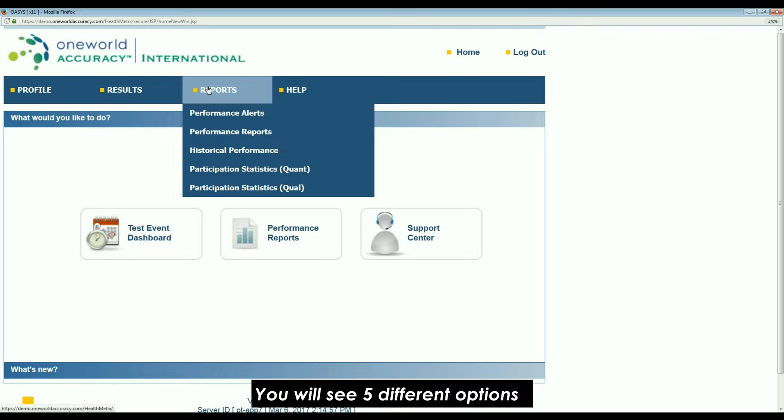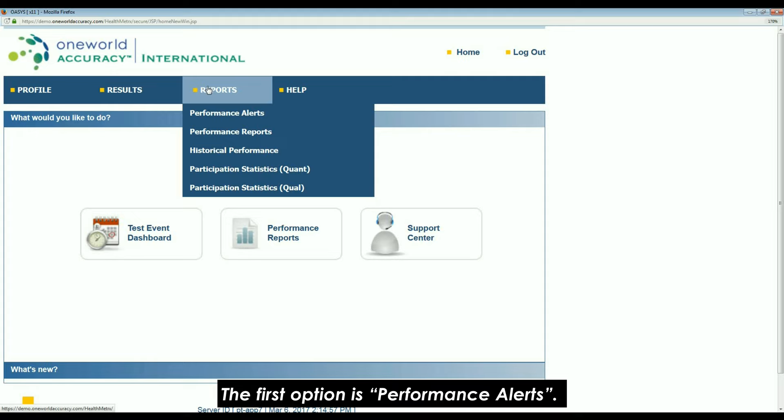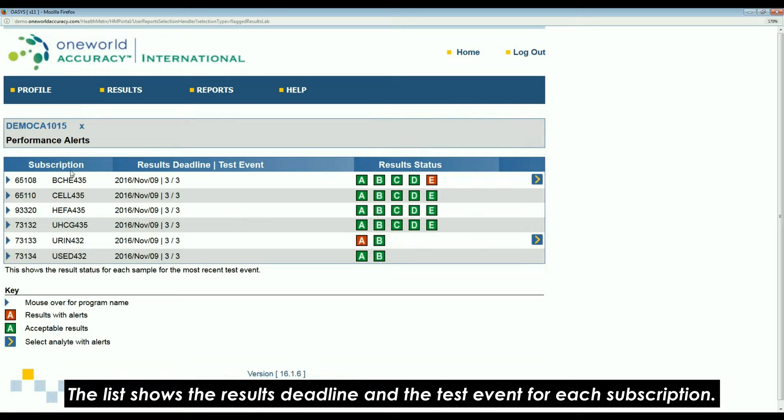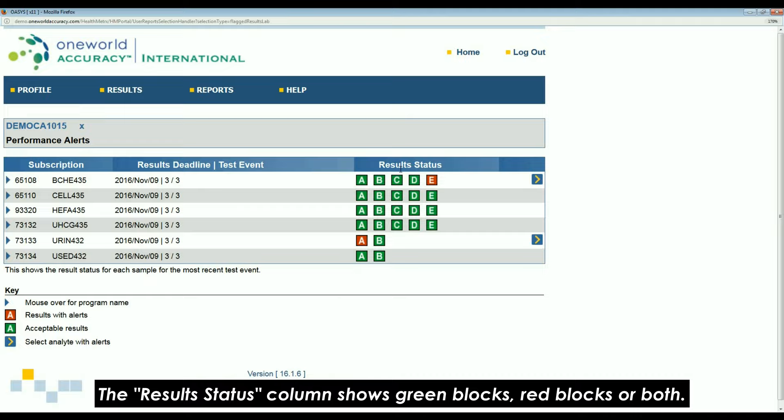Once you have logged in to your OASIS account, click on the reports heading. You will see five different options. The first option is performance alerts — click on it. You will see a list of your subscriptions. The list shows the results deadline and the test event for each subscription. The result status column shows green blocks, red blocks, or both.